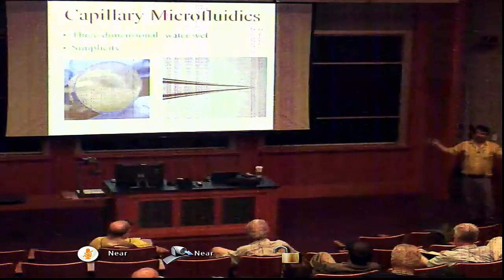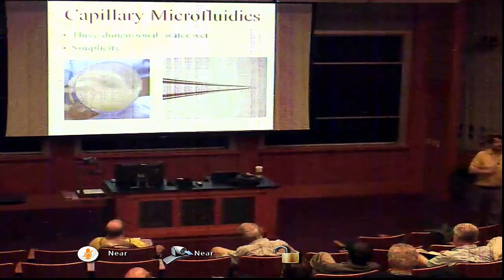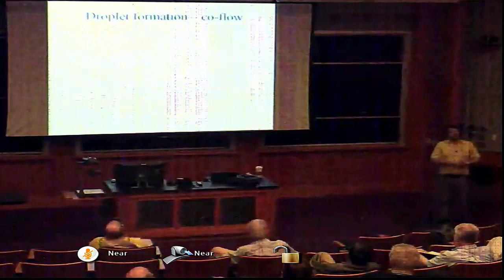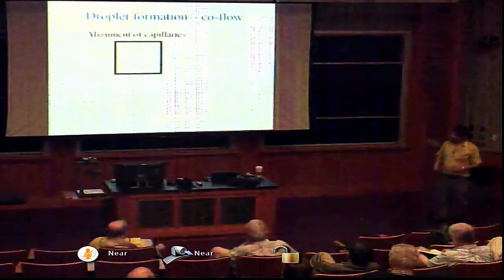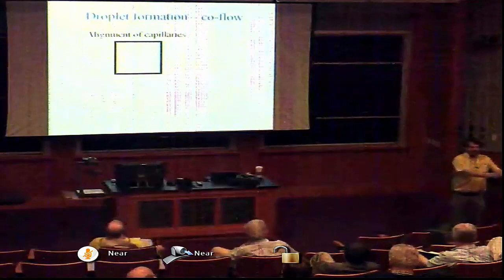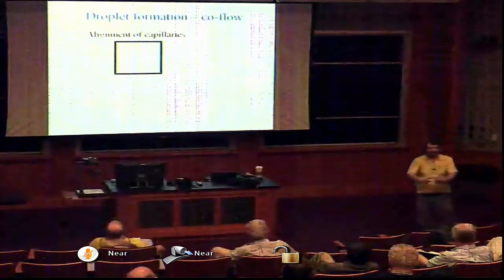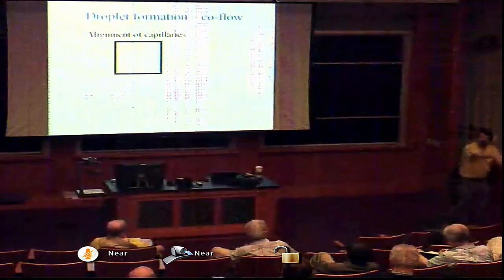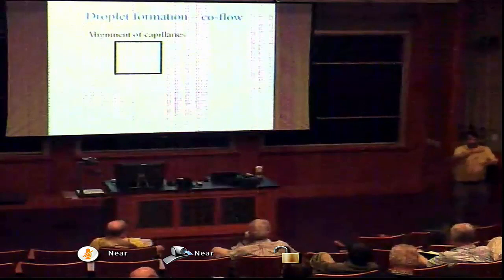Then we have to align them, and you'll see in a few minutes why we want to align them. We want to make devices and align them very precisely, and to do that, we use something inspired by, at least for me, a toy that I had when I was a child. It was a block of wood, very nicely machined or carved, and it had different holes drilled in it. It had a round hole, a square hole, a triangle hole, a rectangle hole, a rhombohedral hole, all these different shapes, and there were blocks that fit right into them. Anybody have one of those toys? You did, yeah. Remember those? The triangle only fit in the triangle, right? It couldn't fit in anything else. You had to figure that out, right? The circle only fit in the circle, it didn't go in the square.